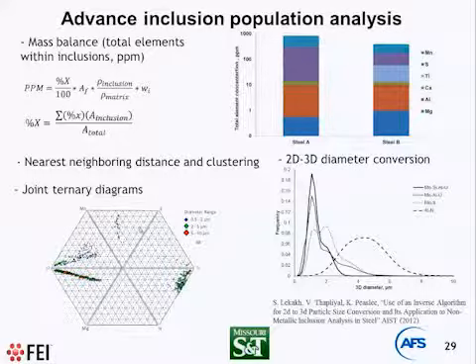So we count inclusion according to 3 main elements, then we remove that inclusion from consideration for next step. And then we distribute that inclusion to the ternary diagram and put all together. In this case, manganese, sulfur, alumina, sulfur, titanium, and so on. When we put all inclusions together, something like this example of stainless steel, we can see all inclusion population. Also, color represents size. And when we see this type of map during processing or compare different steel, it is definitely easy to recognize what's going on.